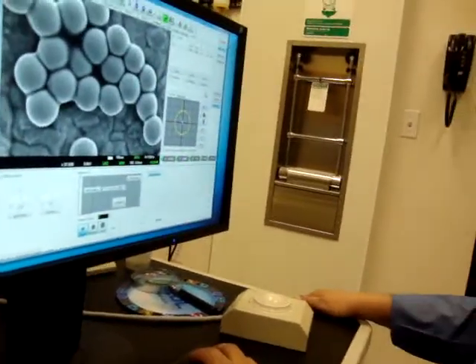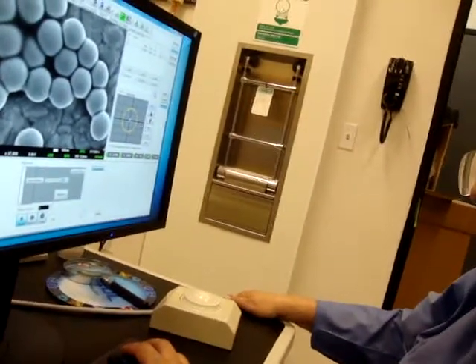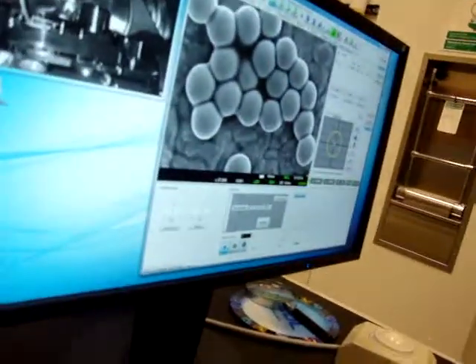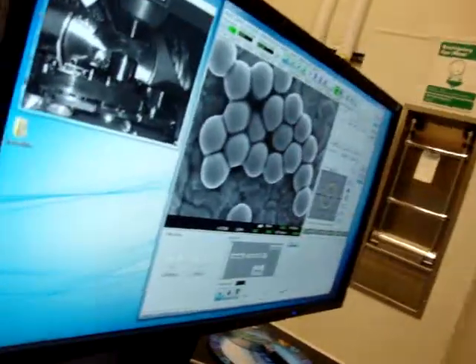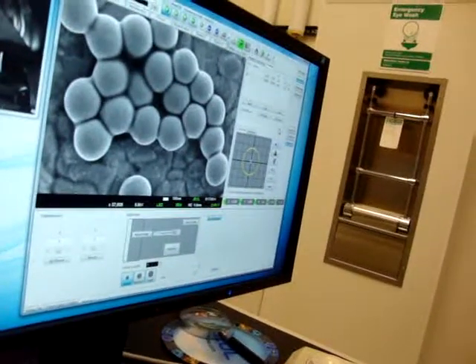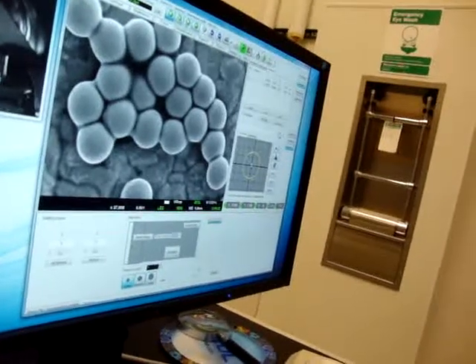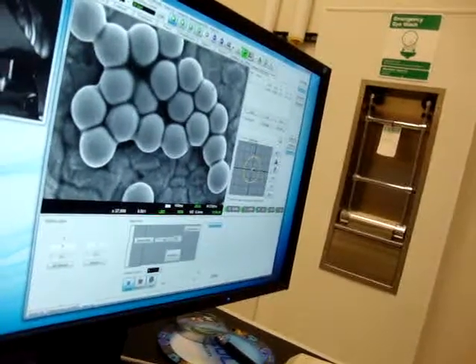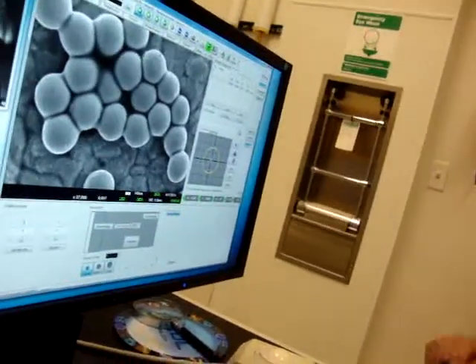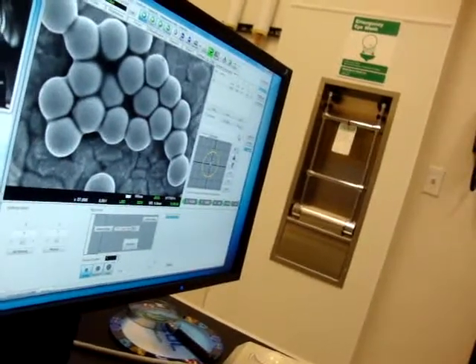So if I want this picture, I'm going to be freezing it first. Well, you would hit photo. Freeze gives you the ability, rather than doing a slow scan, where you can have charging, bands, displacement in your picture, all that stuff. But then you find that if you're working on a faster scan speed, where you're not dwelling on the sample, you don't have this charging. All you have to do is hit freeze. It does one frame, and it's frozen. Then you can capture it.